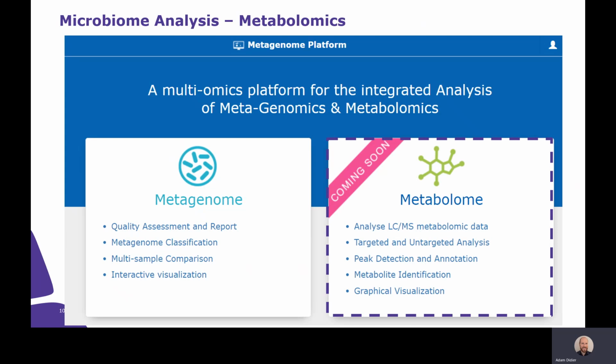The next step is to connect the metagenomics data to metabolomics data to get an idea of the metabolomic differences between these samples and expand on the functional significance of the data. We are in the process of launching the metabolomics portion of our application and currently generate the same wide array of figures separately. We look forward to helping you answer your scientific questions.